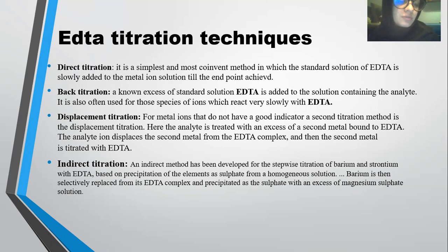What is the back titration? We should all know the back titration. It is a titration technique. In back titration, an excess standard solution of EDTA is added to the solution containing the analyte. It is often used for species of ions that react slowly with EDTA.